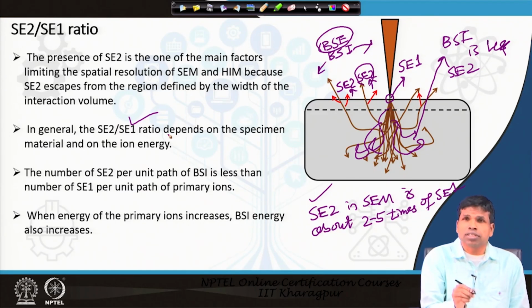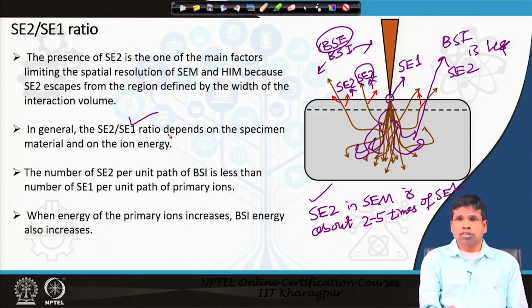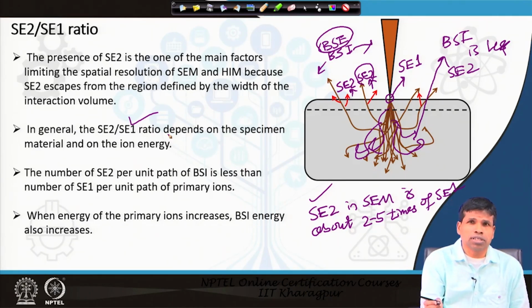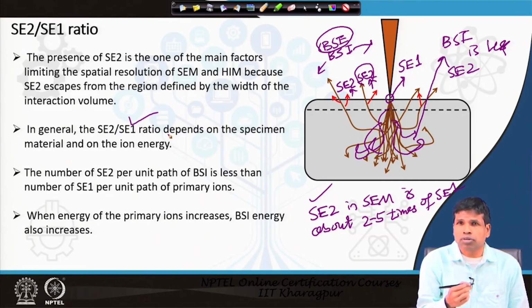Not only that, materials matter. As we know, backscattered electrons are used for composition distribution, because as we increase the atomic number of the material, more backscattered electrons come out, and from that brightness difference we can tell some region has a higher atomic number material and some other region lower atomic number elements. That we have also studied in the scanning electron microscope.